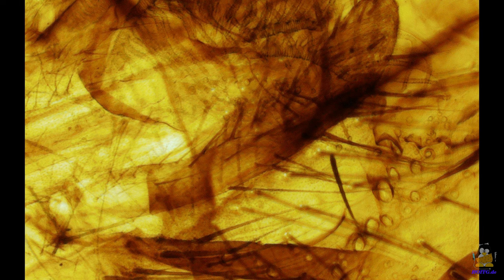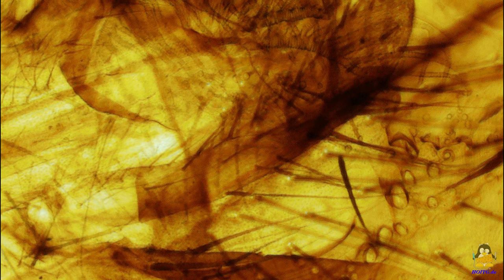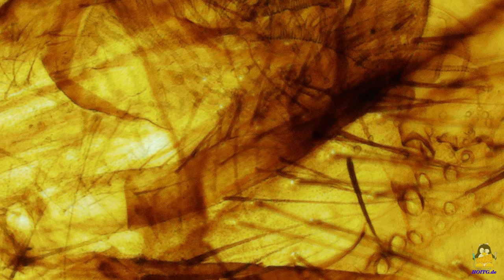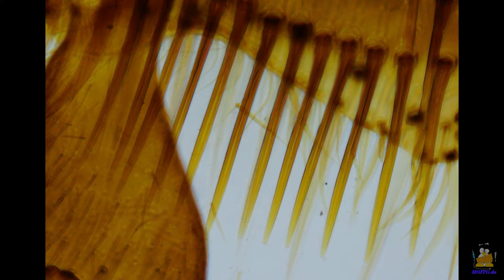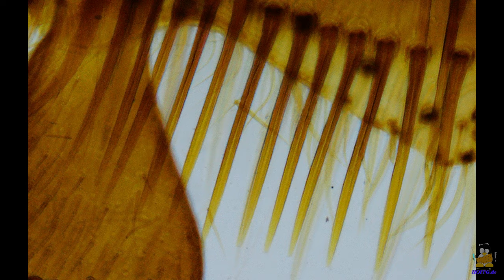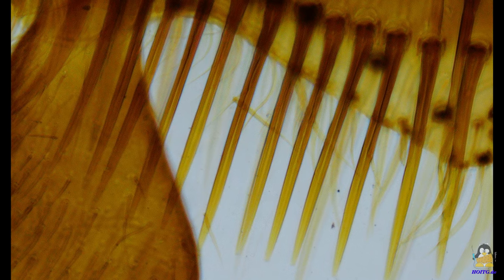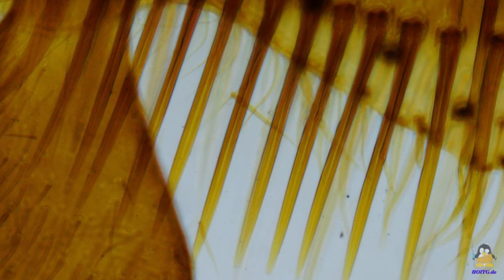The aspect ratio of the recorded still images is 4 to 3. These are saved with a resolution of up to 5600x4200 pixels, which in no way corresponds to the physical resolution of the camera chip. The images are upscaled by software.